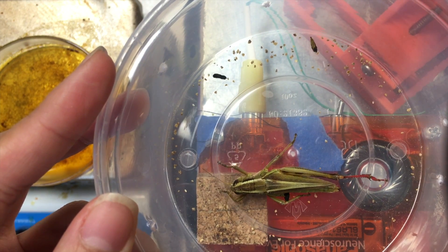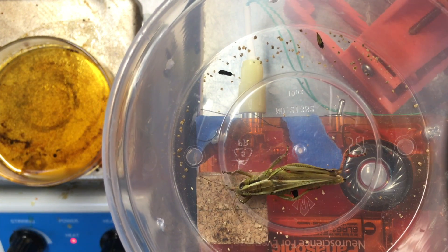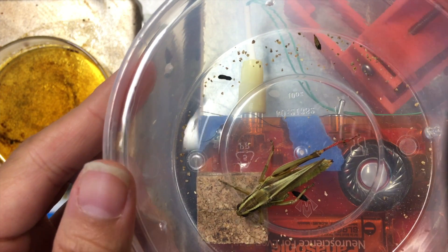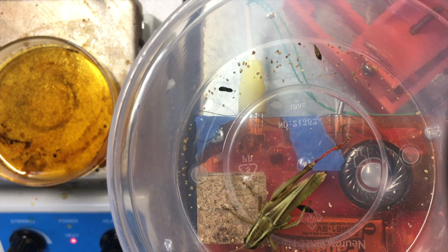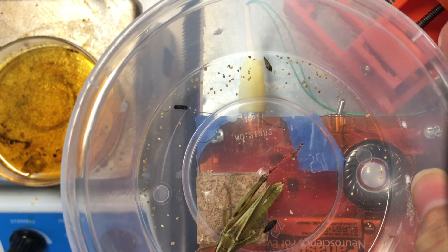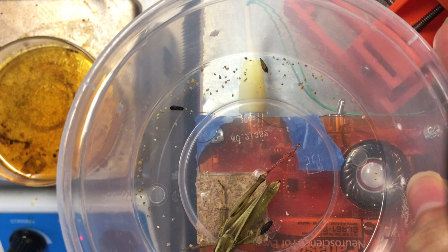I'm studying the neuroscience behind the grasshopper's ability to quickly jump away when it sees an approaching object, like a predator. Their visual system includes a type of neuron called the descending contralateral motion detector neuron, or DCMD for short.